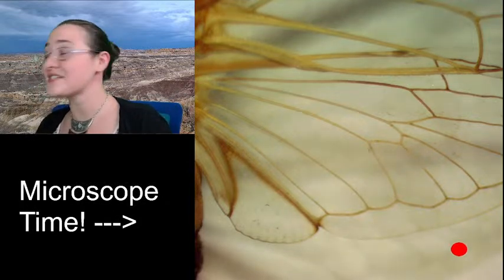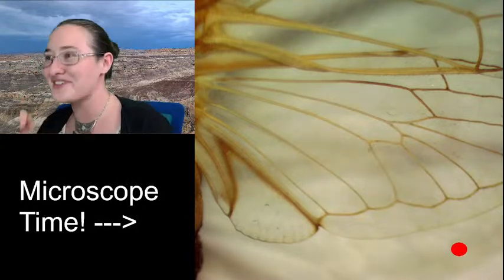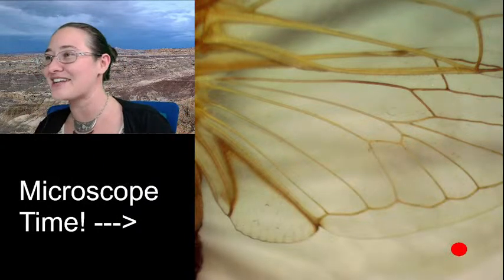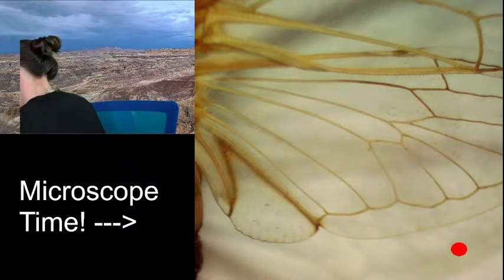There's a couple of things that we didn't get to see when we were drawing dorsally that are kind of interesting for this specimen in particular. The first one is that if we look at the end of the abdomen, I believe that we can see his hook.